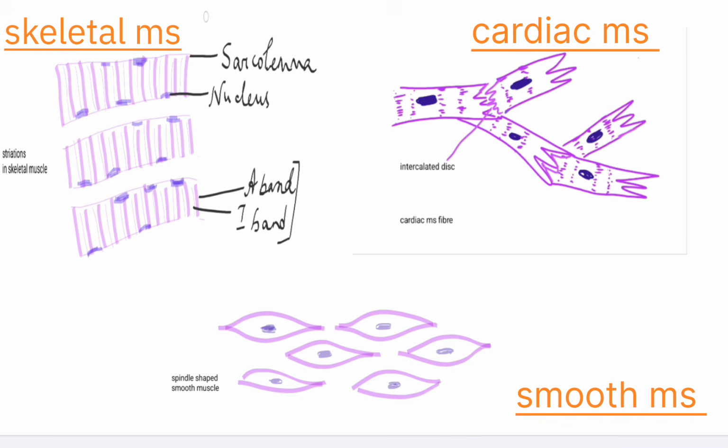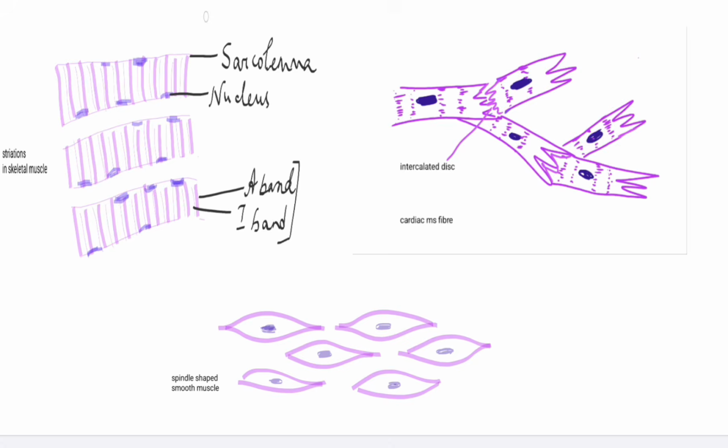These are discrete single strokes at intervals. I will show this in the later slides. Now coming back to smooth muscle, here the fibers appear in a flowy, wavy pattern and they have flat nuclei within, generally a single nucleus at the center.